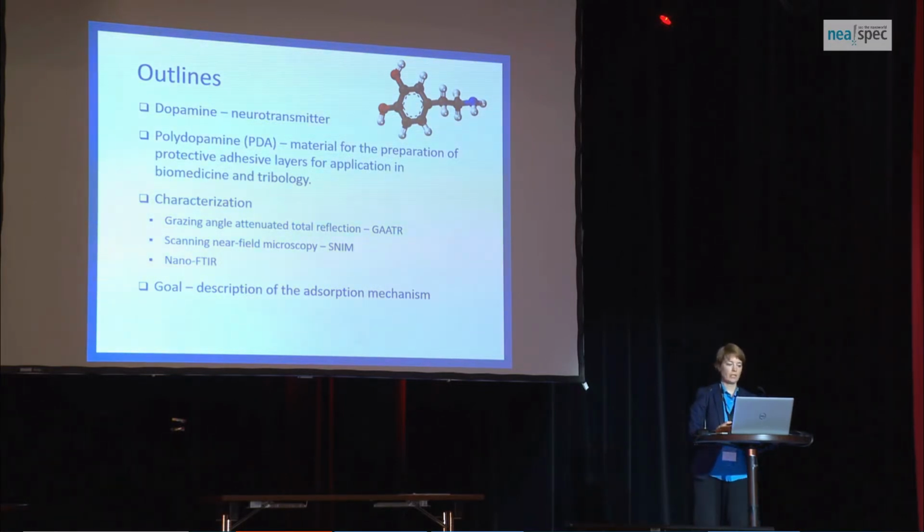The polydopamine layers are of interest for biomedical reasons. We tried to characterize the polydopamine layers from a macroscopic and nanoscopic point of view. Ultimately, the goal of our study is to describe the structure of the polydopamine layers and features on the surfaces.